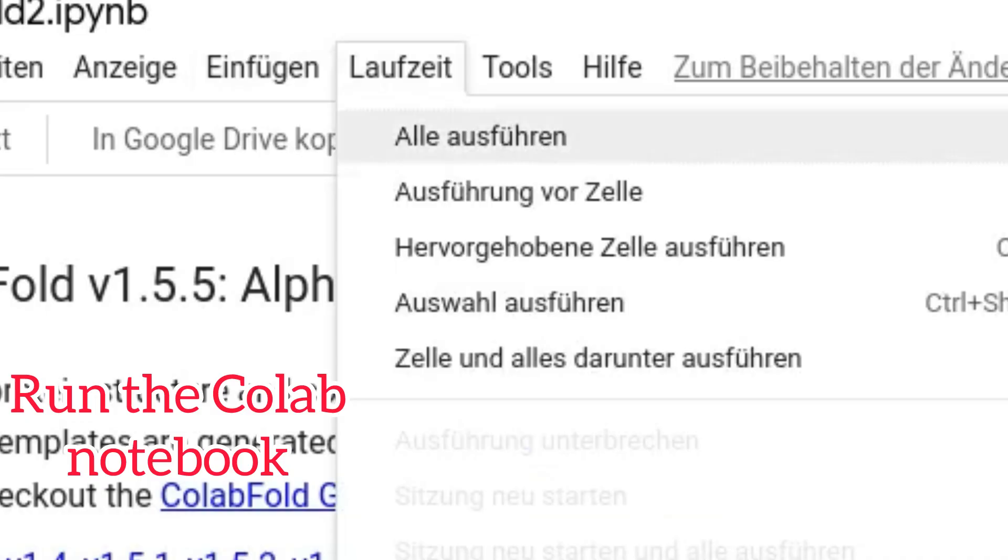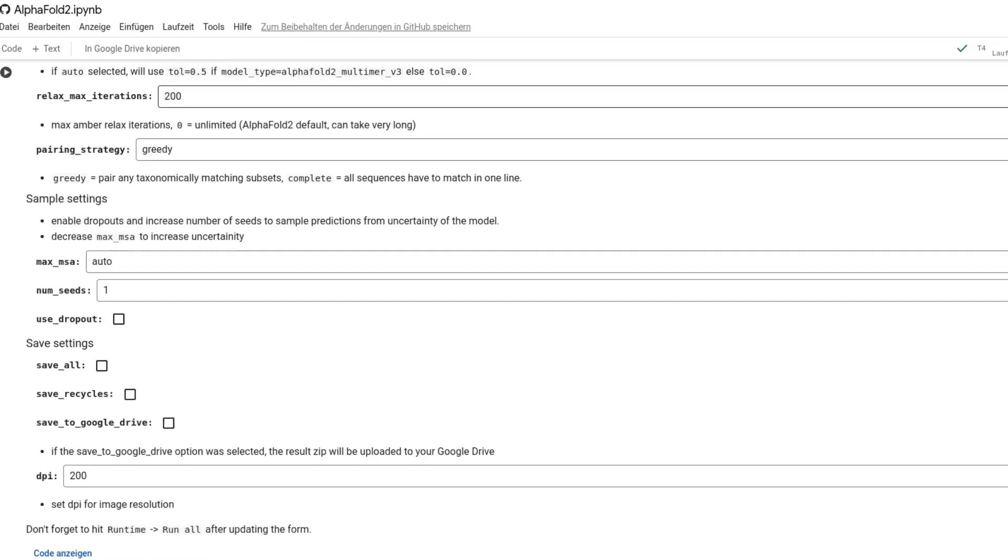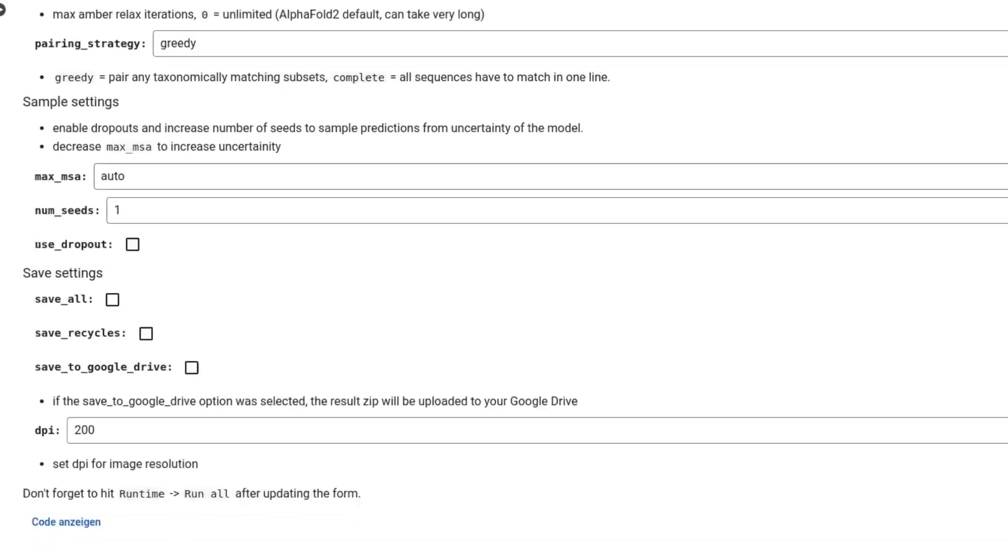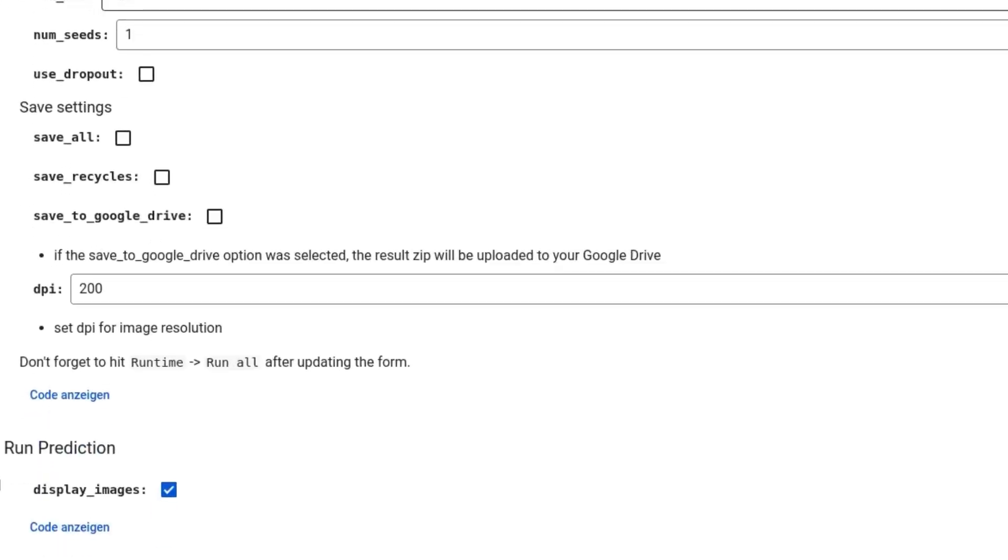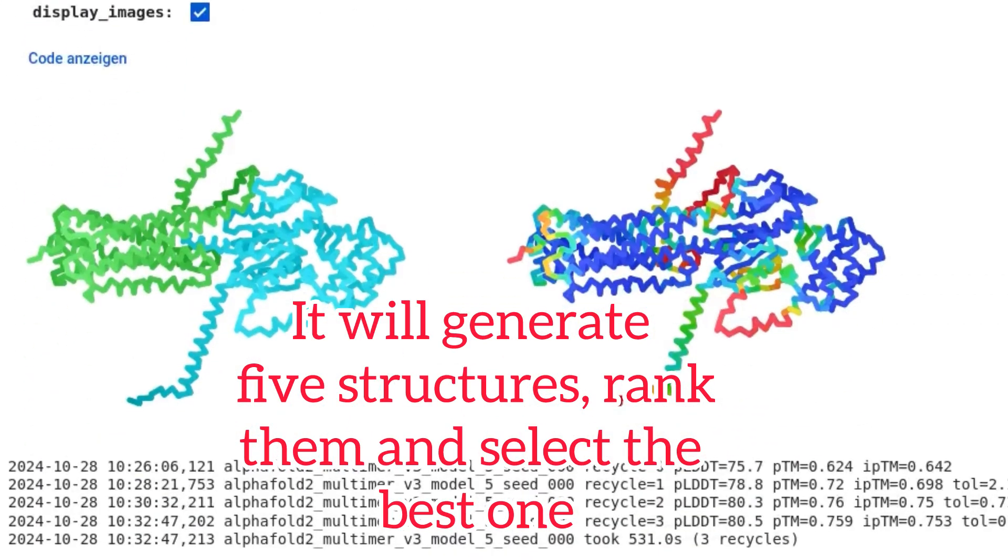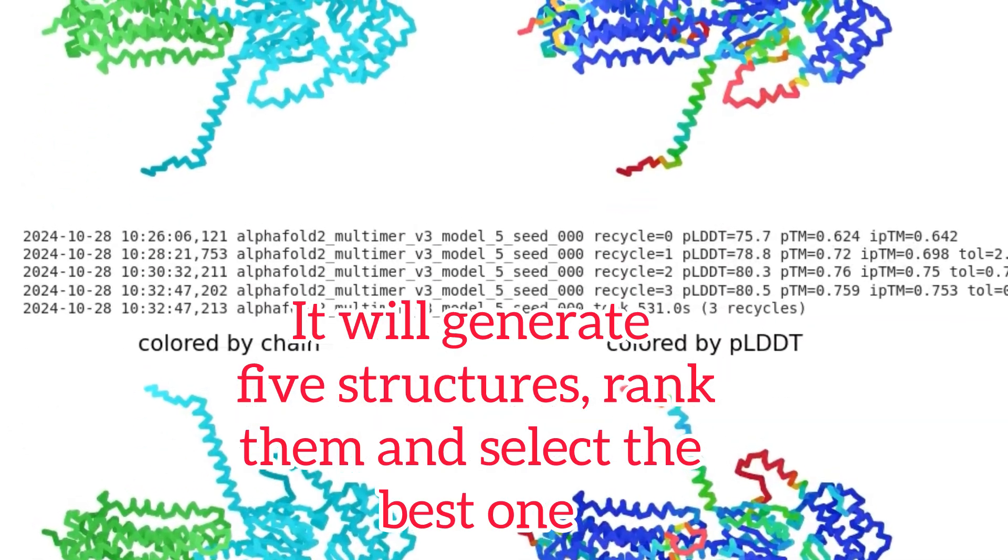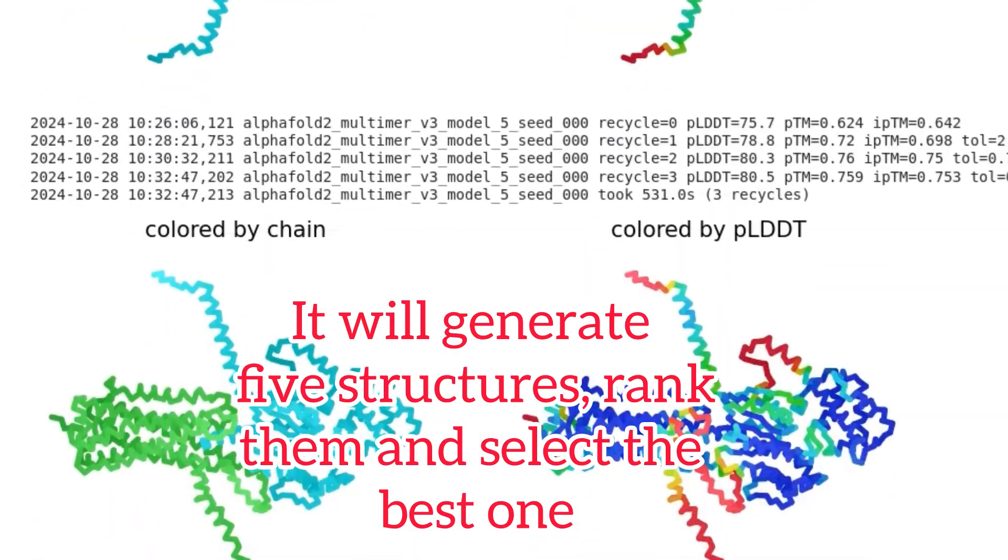Run the Colab notebook. It will generate five structures, rank them, and select the best one.